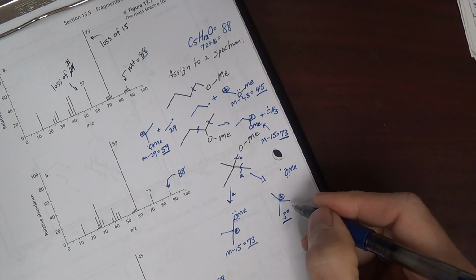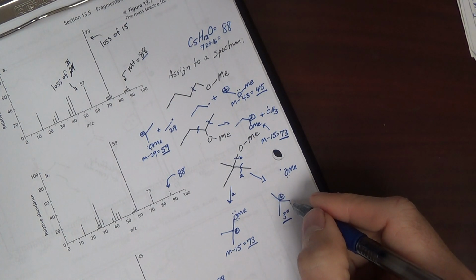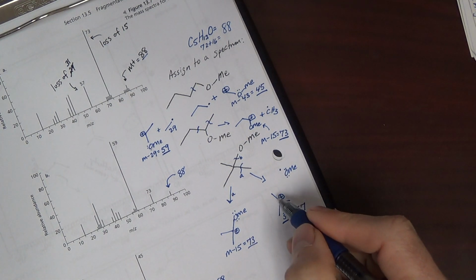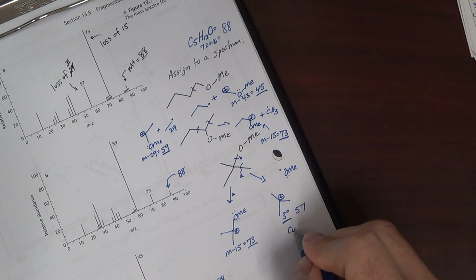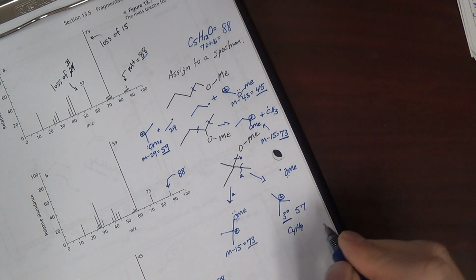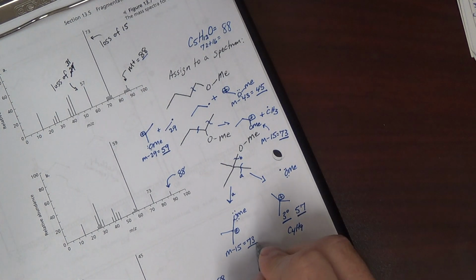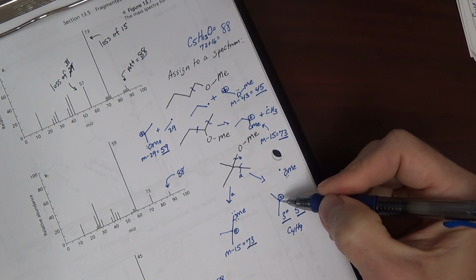And that cation is going to be, what's that, 4, 48, and 9, 57. I'm not going to do an M minus, I'll just add that one up. It should be 57. It should be C4H9, 3 H's on each carbon, 9. 48 and 9 should be 57. Okay. I think it's very reasonable to predict a tertiary cation to be formed here.